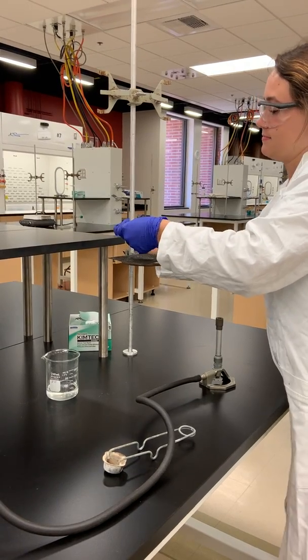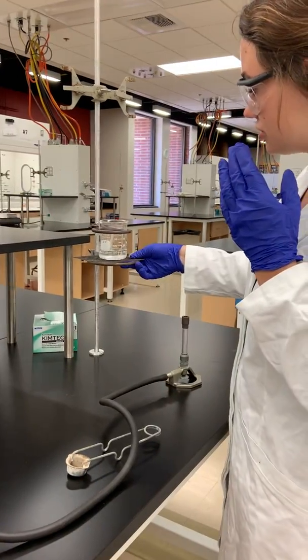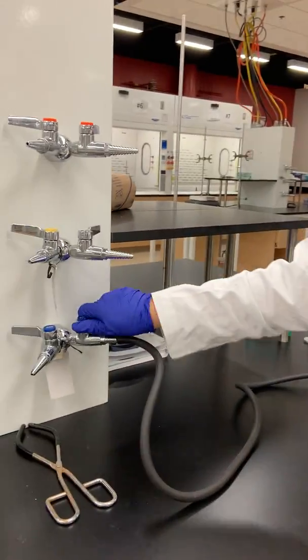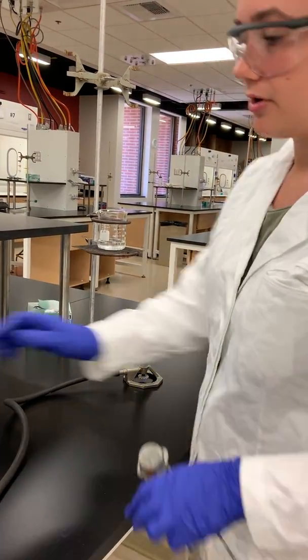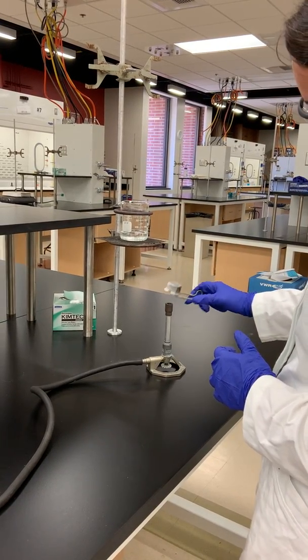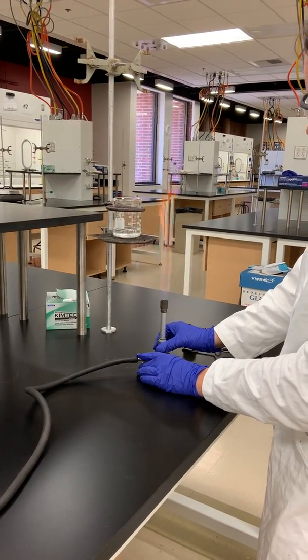Then I'm going to place the water into the ring stand to make sure it's securely fastened and doesn't move around at all. And then I'm going to turn on the gas and loosen this at the bottom so that air can go through. Then I'm going to use the striker to get a flame, and you can use this to adjust the flame in size and height.